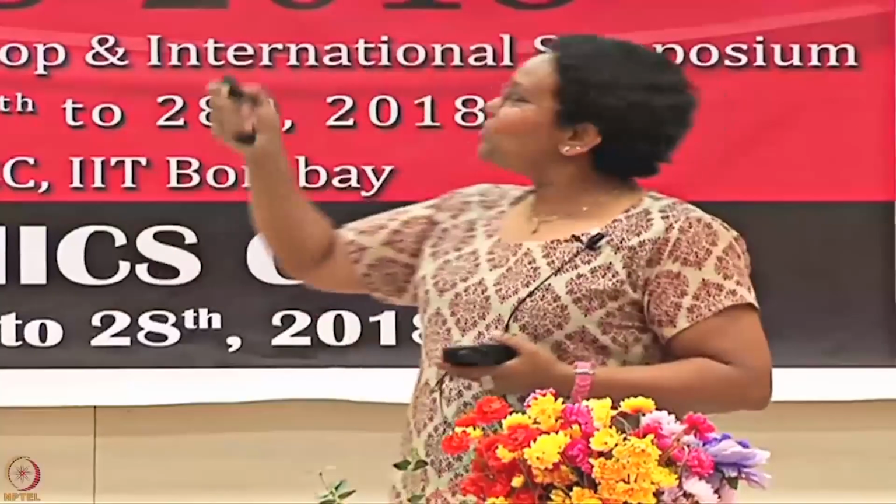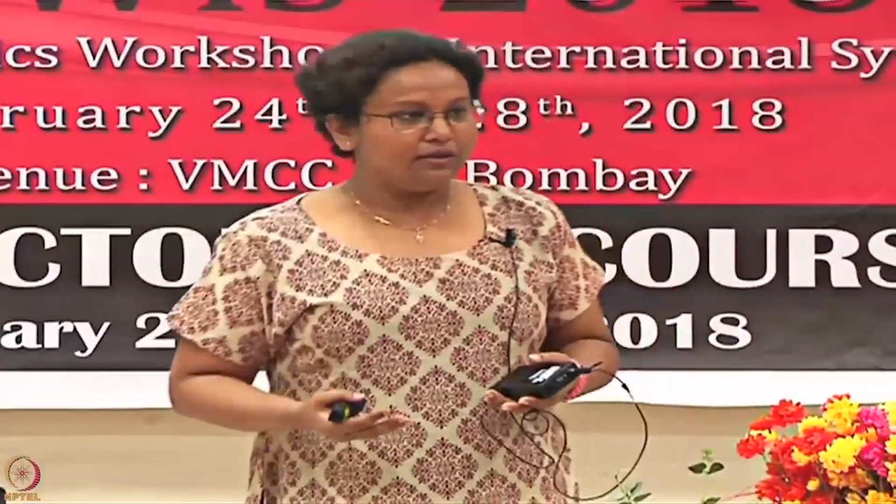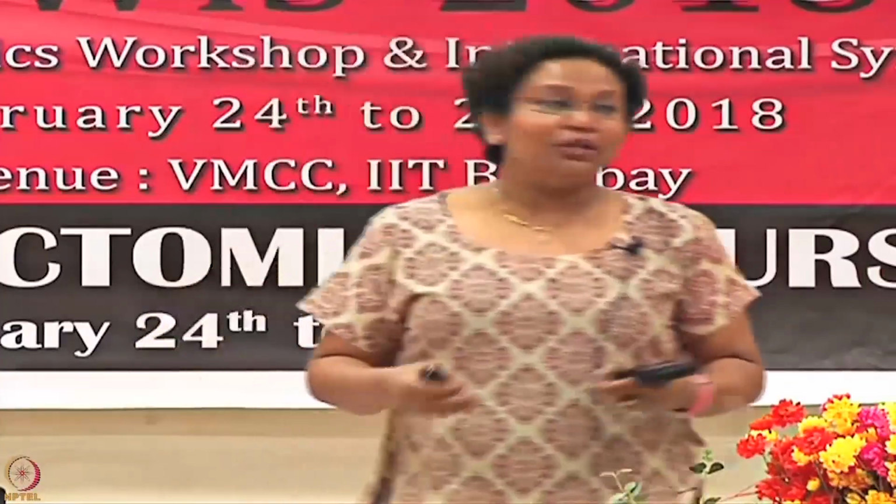So what do you think it means? Does that mean that pH 4 is the best for immobilization? Most people think that the lower the pH we go, the more we can attract the protein and eventually we can get the best. Well, there is some amount of truth in that, but not always.